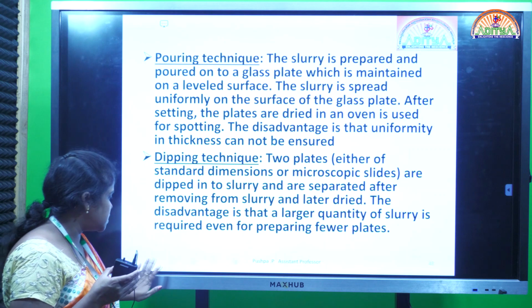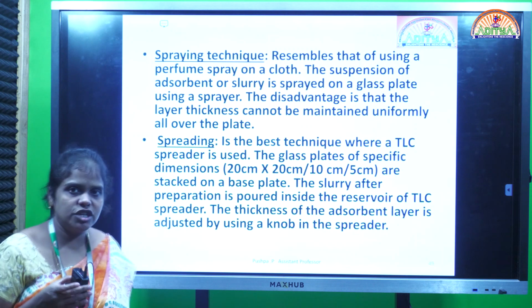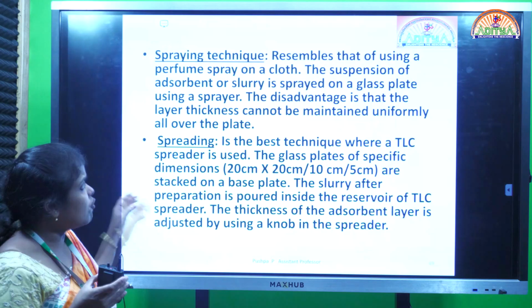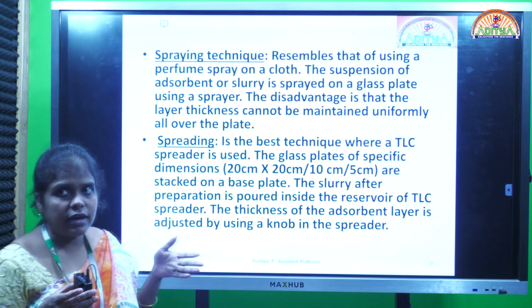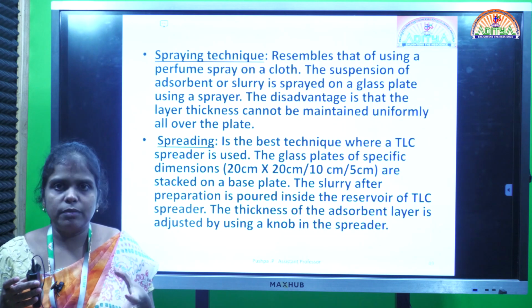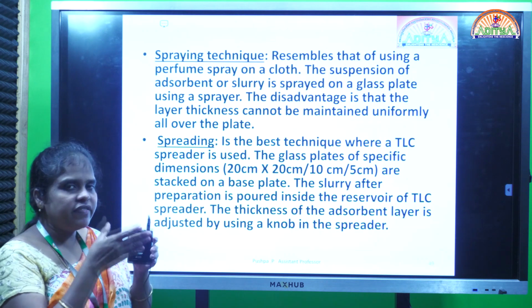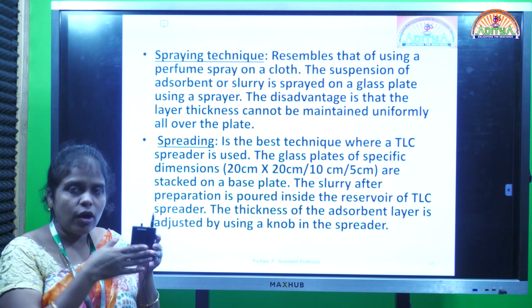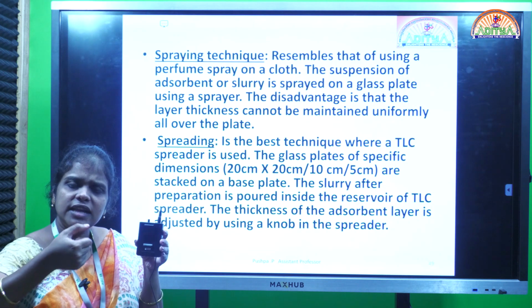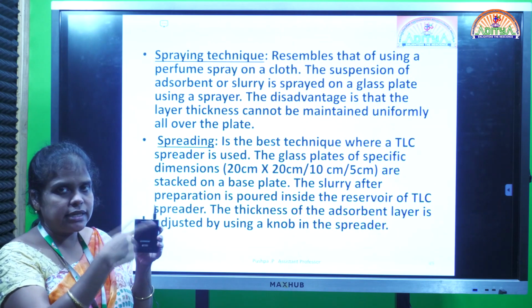And coming to the next preparation technique, the spraying technique. The name itself denotes that we will spray the slurry. That means we will take the slurry in a spraying bottle. Whatever TLC glass plate we take, on that plate, by using this spray bottle containing the stationary phase slurry, we will spray the slurry on the TLC plate.